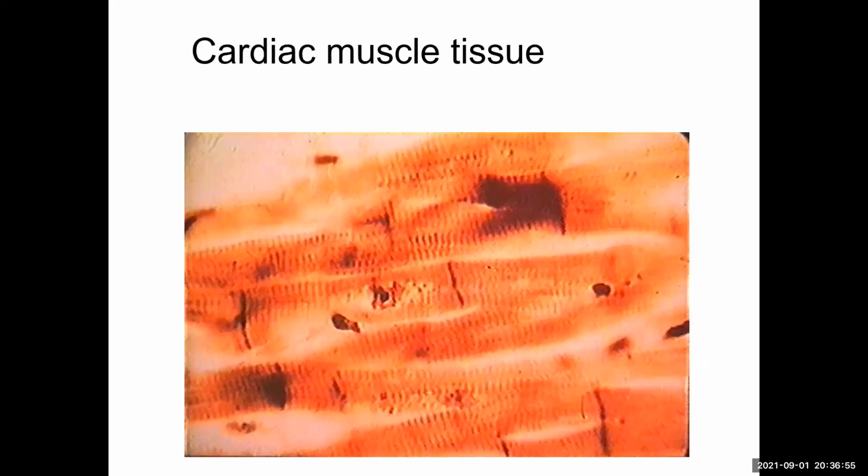All right, the second type of muscle tissue is cardiac. Now that's similar because we do see some striations here, and then you have these big dark lines. Those are the intercalated discs. But you can see where the cells will branch. Here's the cell, then whoops, it splits this way, splits that way. Okay, this cell splits this way, goes down here. Okay, so cardiac muscle cells will branch out. All right, one single cell can have 1 or 2 nuclei.